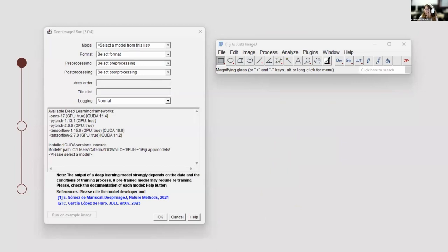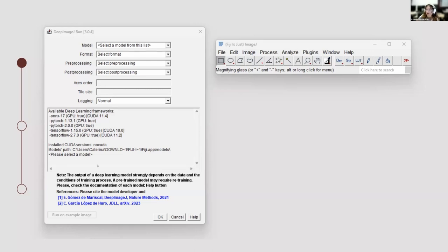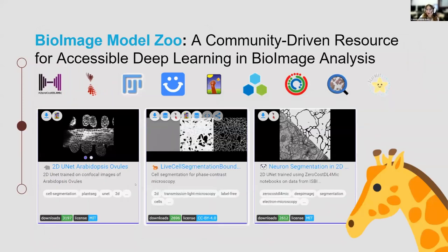This is how DeepImageJ looks like. We are on version 3.0 now — these are screenshots from yesterday. Basically you have Fiji, which is just this small window where you can do many different tasks. When you select Plugins, you can go to DeepImageJ Run and just run the model on an example image from a model you've already downloaded, for example from the BioImage Model Zoo, or on your own images.